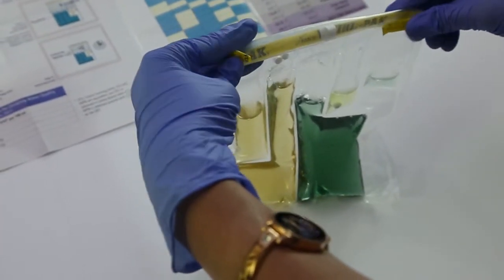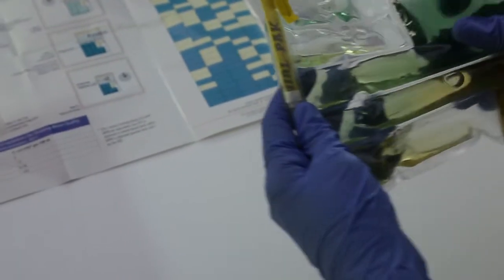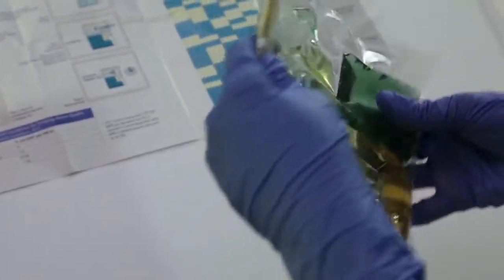Complete instructions for using the High E. coli test kit are in the instruction sheet. Please feel free to write to us with your queries. We look forward to hearing about the test results from you.